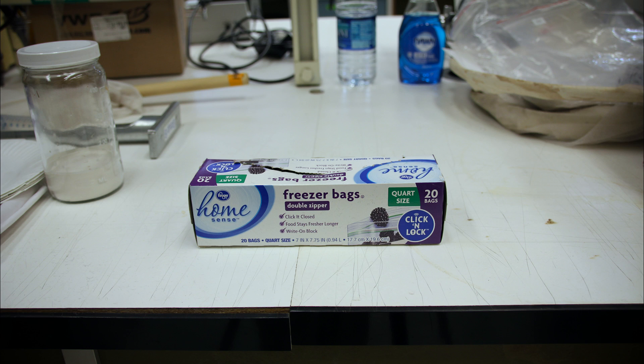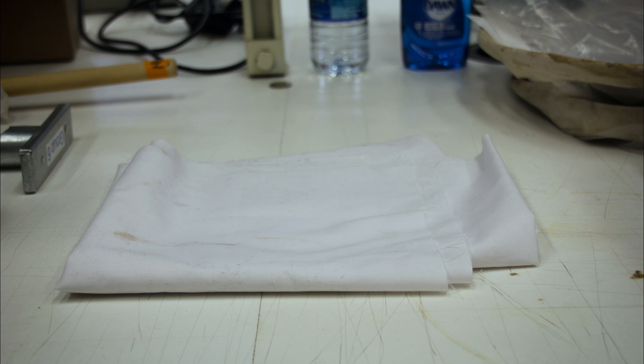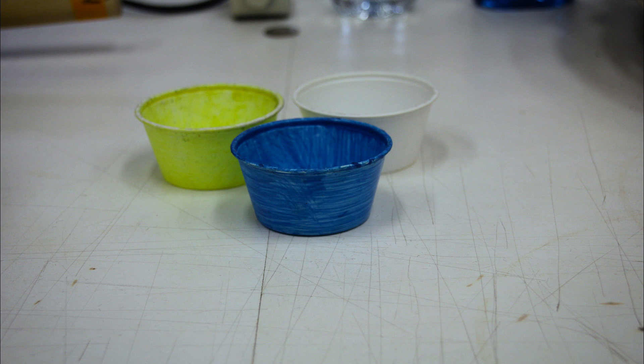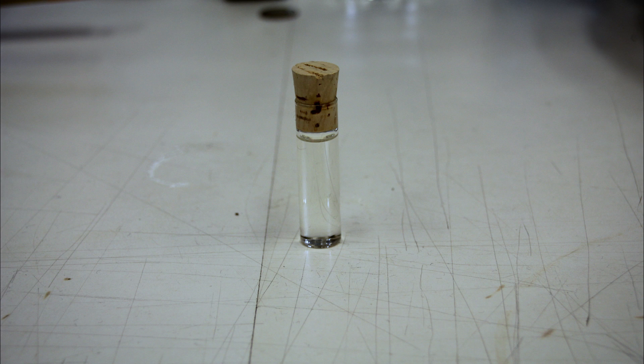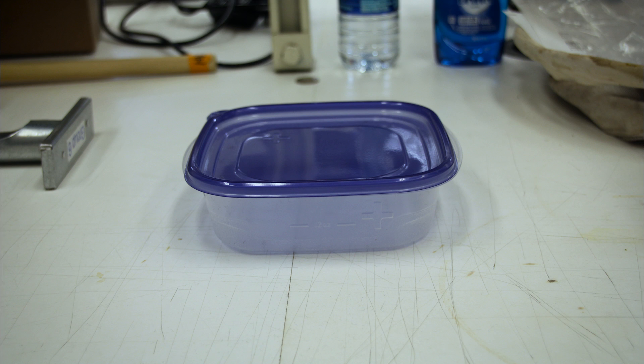Ziploc bags, paper plates, small paint brushes, a white sheet, forceps, bowls or a 50-milliliter tube that can be used for traps, a kill jar, an insect net, and plastic containers.